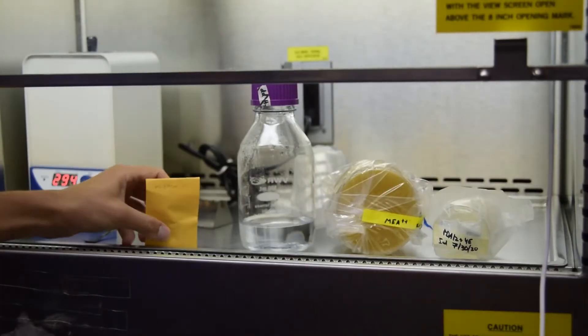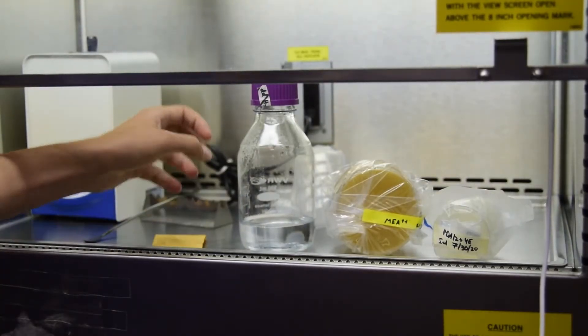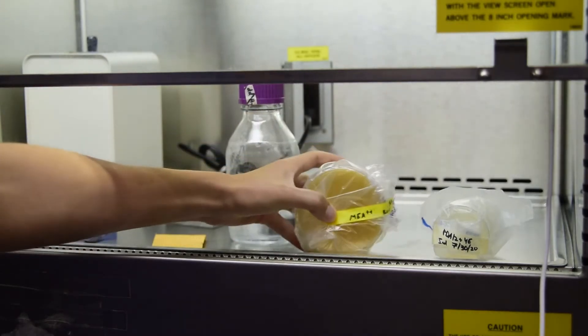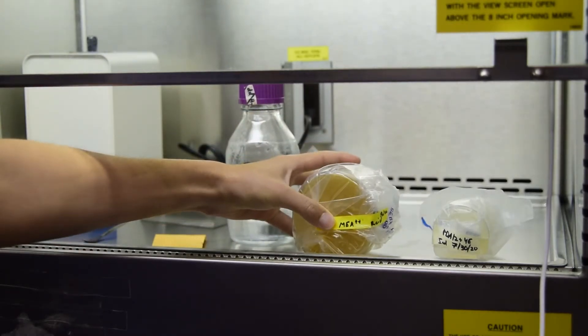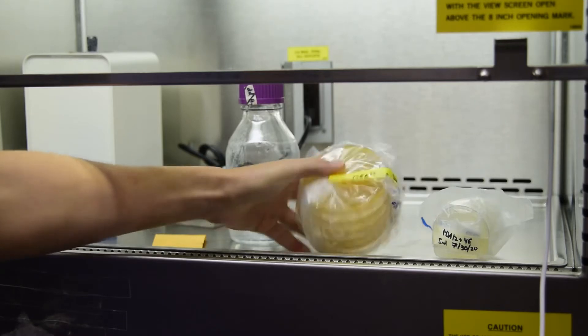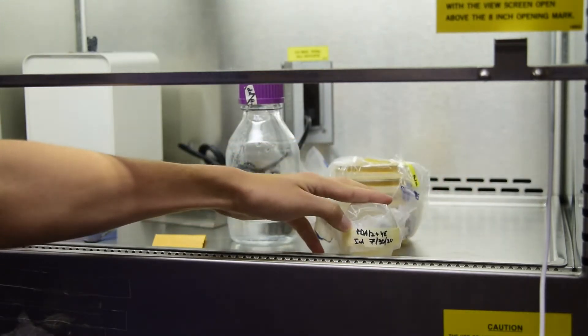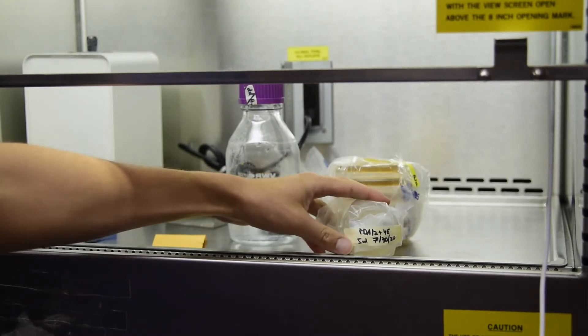You will need the soil or other substrate, sterile water, nutrient media on 100mm plates with antibiotics (the plus plus symbol), empty 60mm plates, and 60mm nutrient plates without antibiotics. Your hands should be washed and sprayed with ethanol.